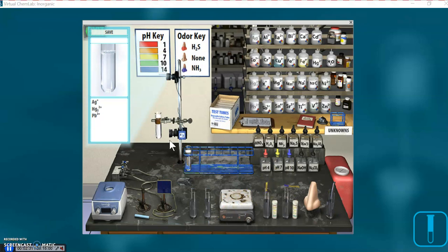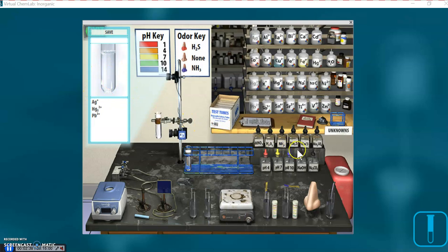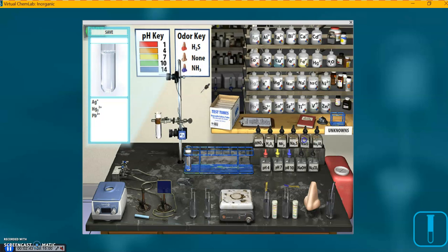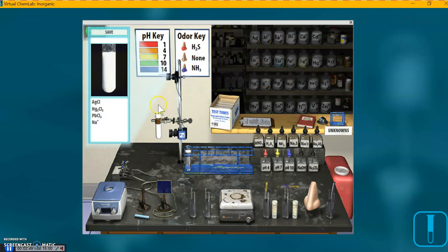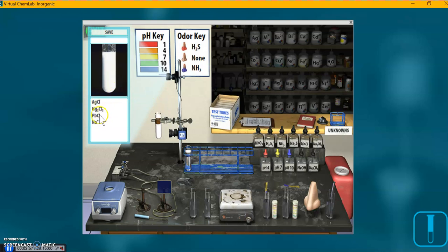Okay, we're going to try some qualitative tests. Notice in the zoom in screen here, we have a nice clear solution. I'm going to click. See the little becomes a little dropper, the mouse pointer. And click NaCl, and notice what happened here. There is a change. And you can record your observations. You can also look down here. You can see what happened here. We actually have some precipitates, some insoluble compounds.